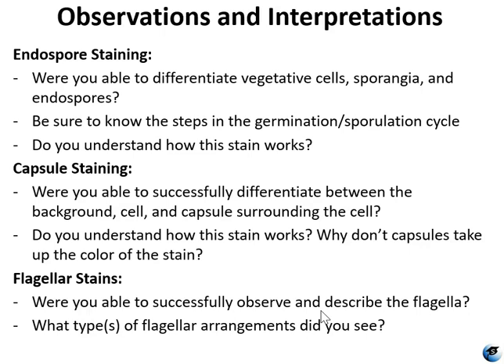Make sure you know why capsules don't take up the color of either of the stains, the acidic or the basic dye, right? And then for the flagellate stains, were you able to observe them? Could you see them? Could you describe the flagella? And what kinds of arrangements did you see?